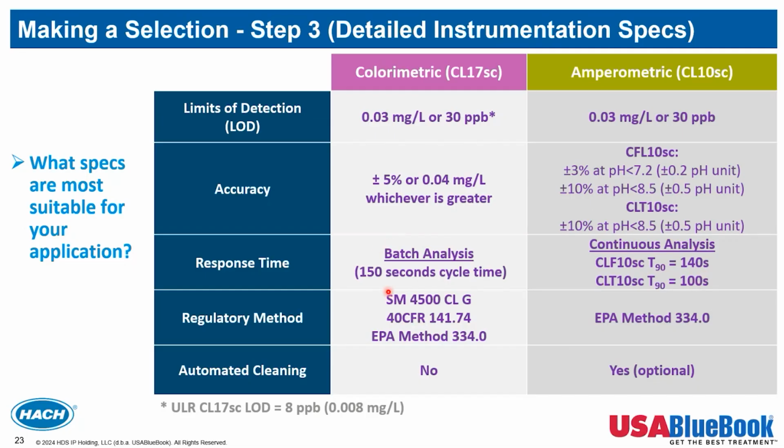Then response time. Once again, same question. What is more important? Fast response or accuracy? Now, regulatory. What method is acceptable by your regulatory authority? Do you have to go through IDC or standard method 4500 or 40 CFR is acceptable? Automatic cleaning. Is it needed? Is it not needed? Etc.